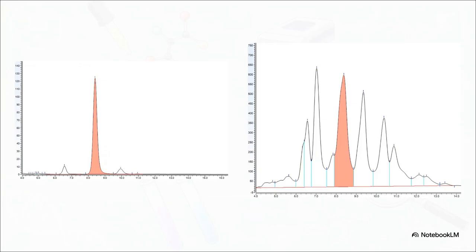To tackle that problem, Dr. Chem's experiment utilized high-performance liquid chromatography, or HPLC. Looking at the specific chromatogram readouts from their study, you can see the system perfectly separates and measures the cholesterol peak. It's that tall red spike hitting precisely at 8.4 minutes in the mouse brain tissue. And the real game changer of Dr. Chem's work? They proved they could do this without needing complex chemical alterations of the sample beforehand.